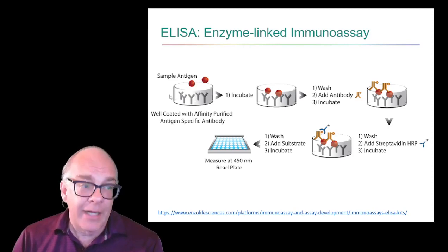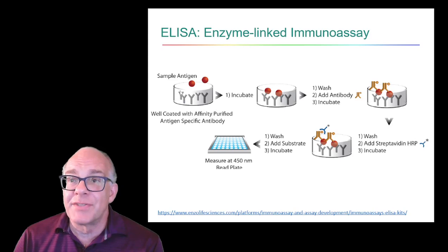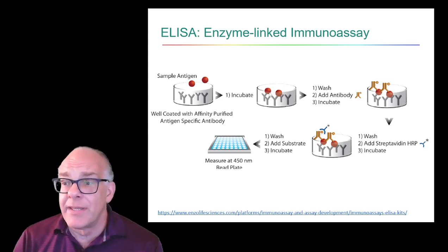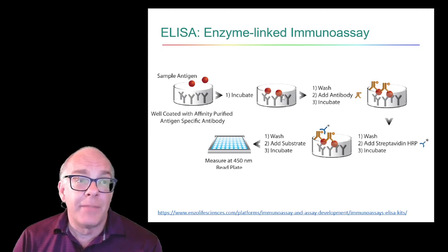And so we're going to put the antibodies into a plate, and so we've got a multi-well plate located down here. Each one of these little wells is going to have antibodies in it, and we put different samples and run through this different reaction. And so we're going to take our antibodies located on our plate, mix it with our sample, and basically if cortisol, or if the little red dots are present within our sample, they are going to be able to bind to the antibody and be trapped there.